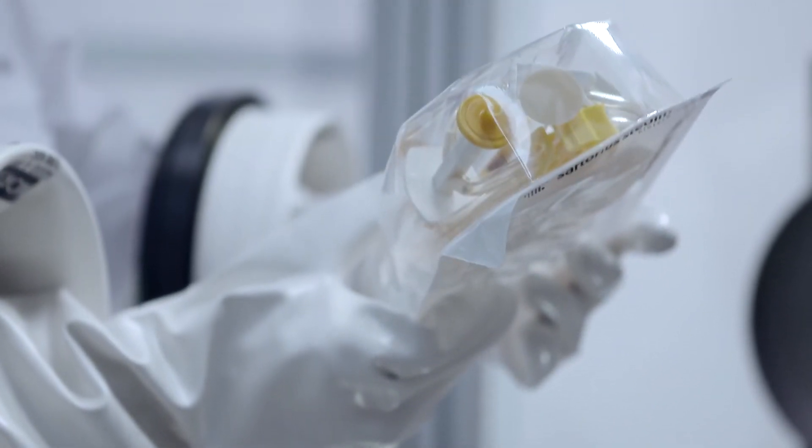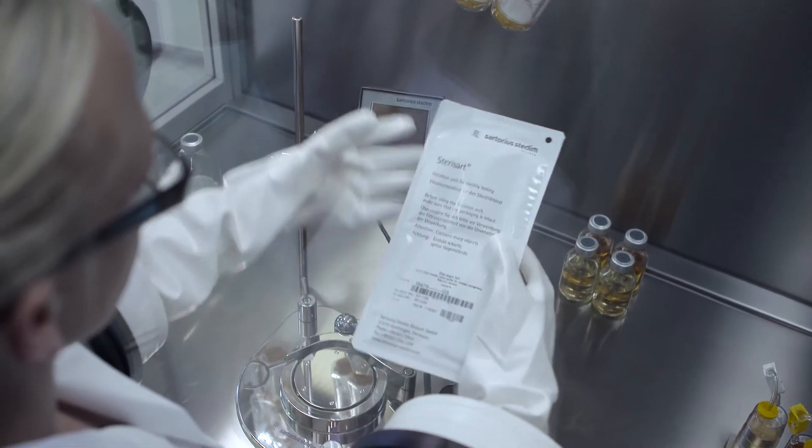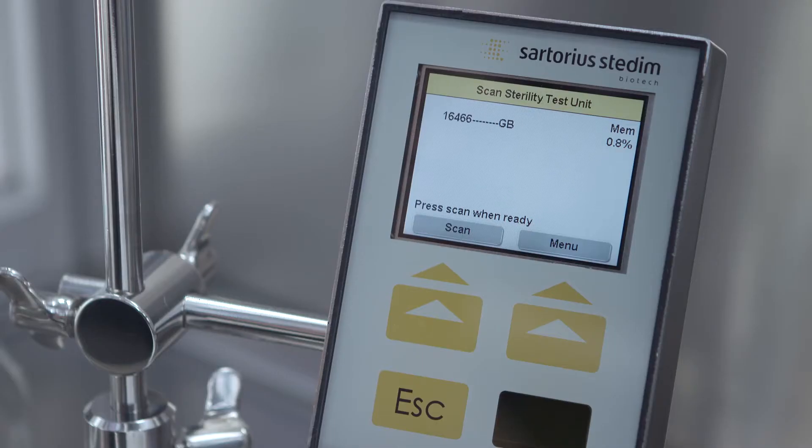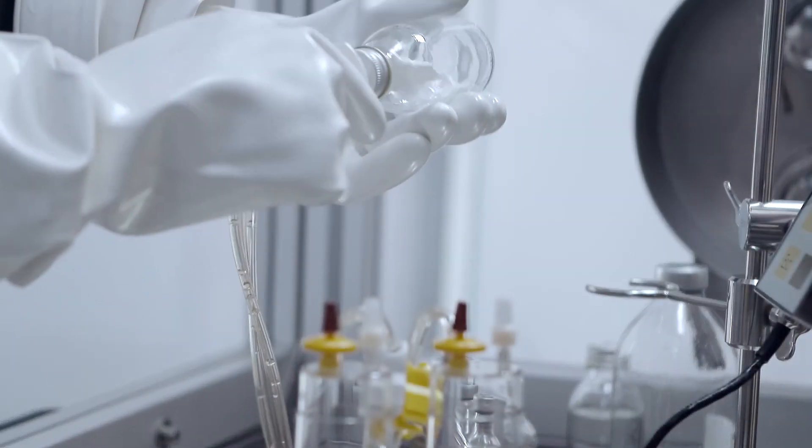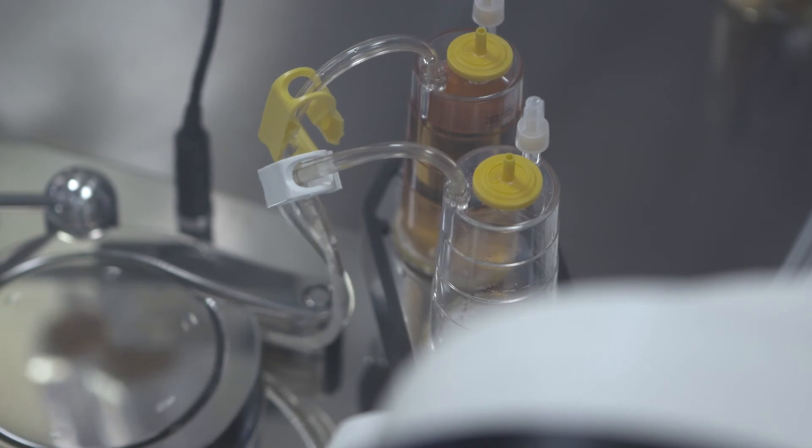A gas-impermeable packaging for direct use in isolators, bar-coded packages for immediate traceability with the Sterisad universal pump, a protective shield to avoid injuries, and an anti-foam inlet.